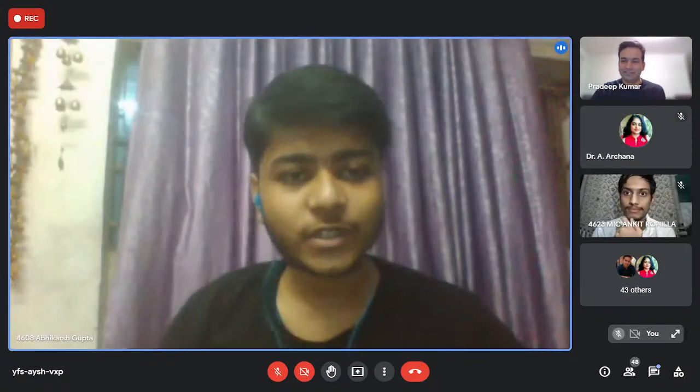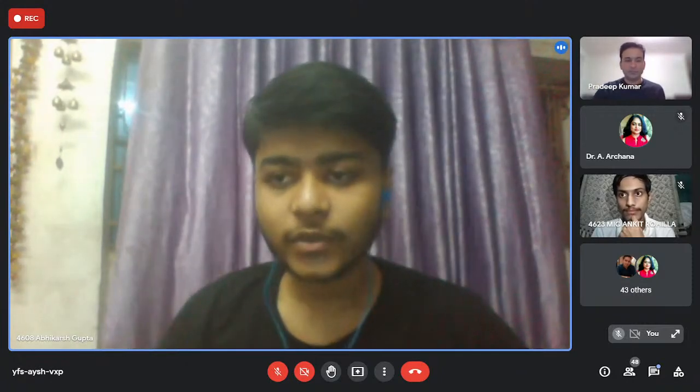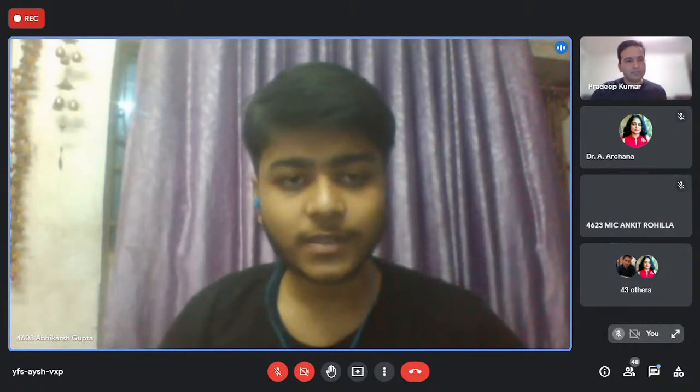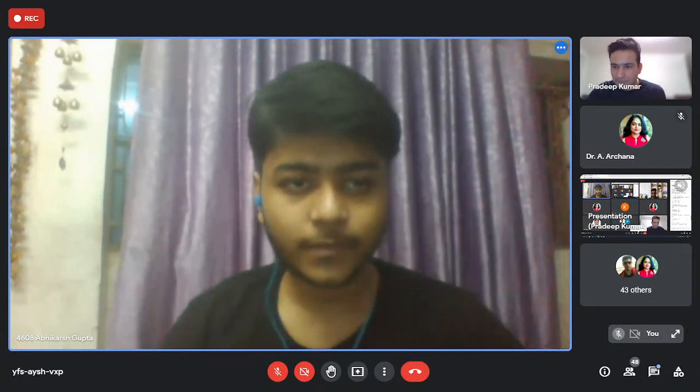Thank you, sir. The next question is: by using flow cytometry, is it possible to distinguish cells that have been infected with a lysogenic virus, in which the viral genome is integrated in the genome of the cell?